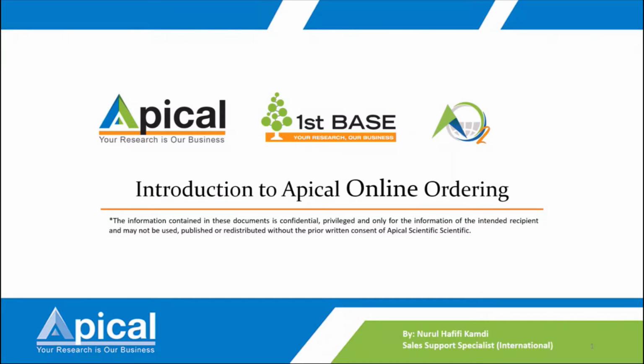The limit for Sanger sequencing is that if you have multiple samples inside, you can only sequence one type of DNA. So if you have multiple sequences inside, then you cannot use Sanger sequencing. Then you need to go for next generation.